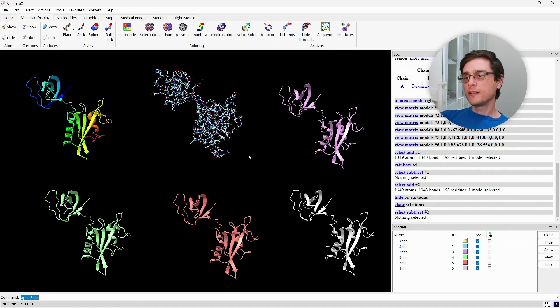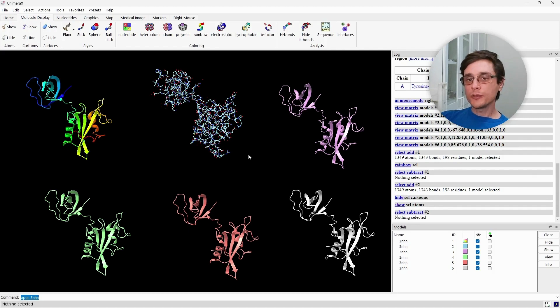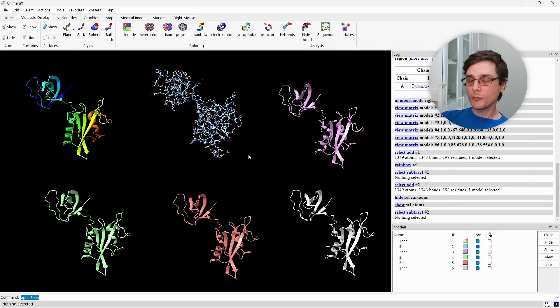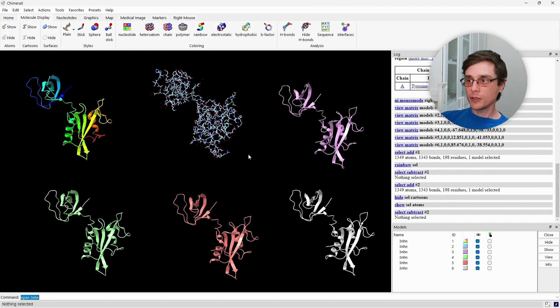You can see that this is not the most convenient way to display a large protein. We usually use the atomic representation for smaller molecules. But it's there if you need it.